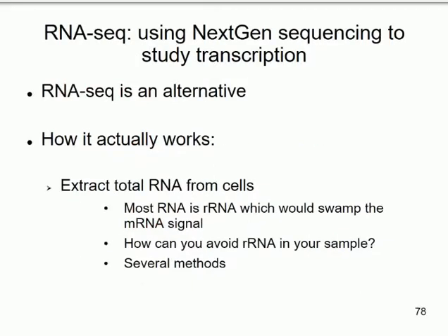So we'll take a look in a little bit more detail at how RNA-seq works and take a quick look at a couple of examples, and then I think it will be time to say something about taking that even a step further and looking at translation.